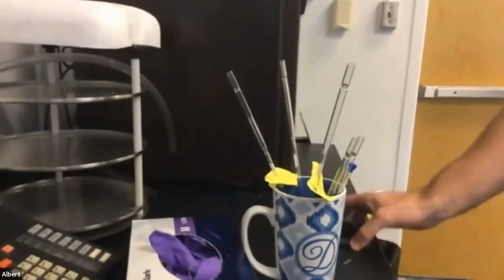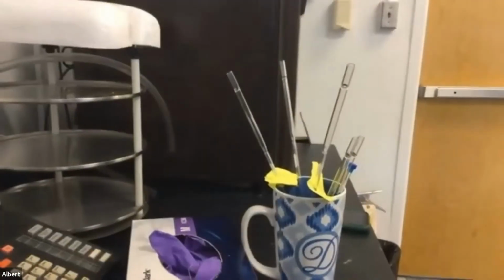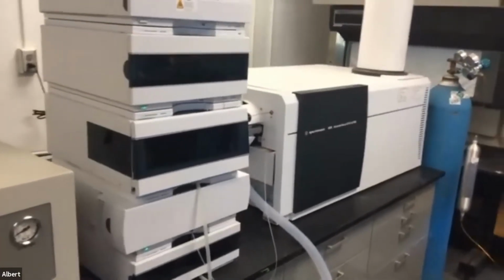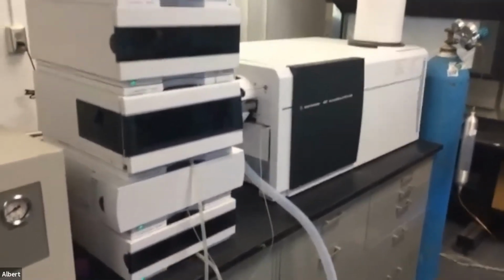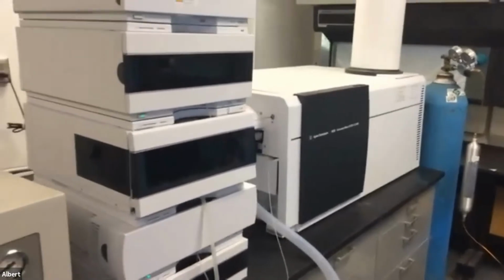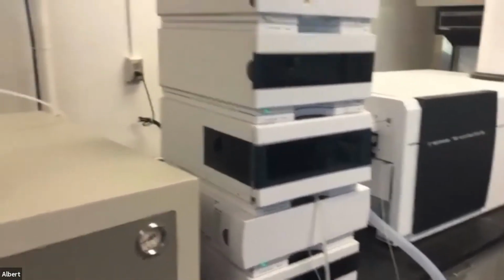Okay, we are now downstairs in the NMR lab, and I'm going to give you a tour first. It's kind of loud in here because of the mass spec. This is the mass spectrometer. It's a QTOF, which is time of flight, LCMS. This instrument is probably close to $700,000. And mass spec, it allows us to look at like the molecular weight of a molecule plus whatever fragments it breaks into. And then this instrument is our NMR.